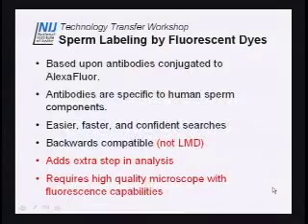Backwards compatible, but not with the LMD, for laser microdissection. These are techniques that you can use on regular glass slides, although you cannot dissect the sperm off there. If you have this fluorescent attachment, you can still look at the older slides and stain them with a fluorescent technique. You simply cannot take them off, at least by the Leica or some of the microscopes.